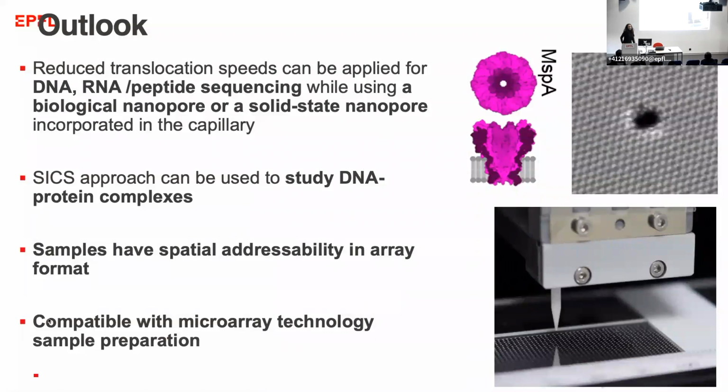Leveraging the capability of the scanning, we can also spatially address molecules. There is a big advancement in the field of microarrays, where molecules can be spotted, and in molecular diagnostics this is a very well-known tool. So we can envisage that this technology is compatible with microarrays as well.